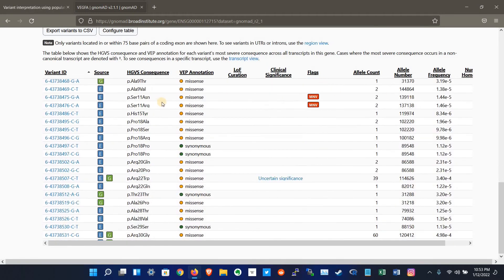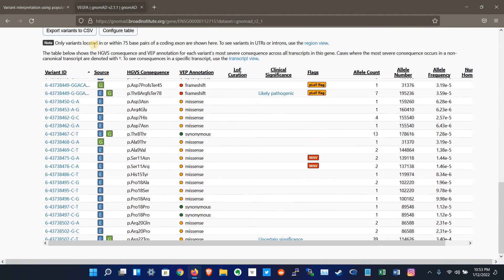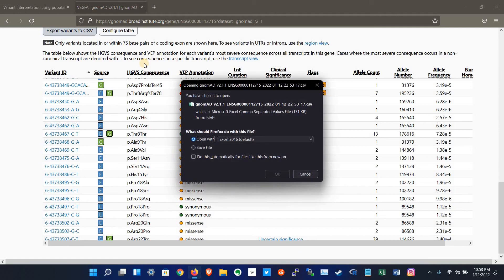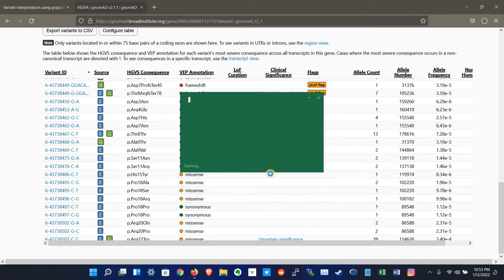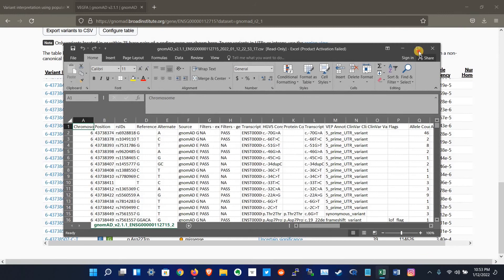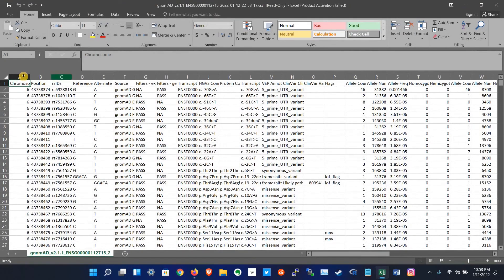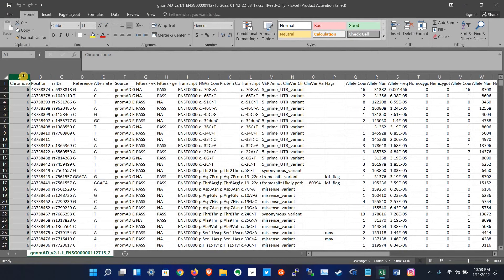And you can also download these variants in this CSV file, like this. After downloading, you have the list of all the variants which are present in your gene of interest.